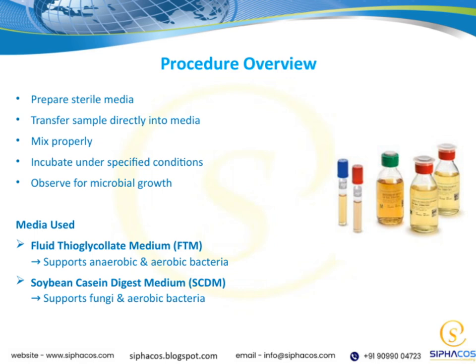fungi. Now, regarding the media used, we have fluid thioglycolate medium, or FTM. This medium is particularly versatile because it supports both anaerobic and aerobic bacteria, making it ideal for detecting a wide range of microorganisms. Then there's the soybean casein digest medium, or SCDM, which is great for supporting fungi and aerobic bacteria. Choosing the right media is key to accurately identifying the types of microbes present in your sample, and that ties directly into the overall goal of our testing process, ensuring reliable and comprehensive microbial detection.